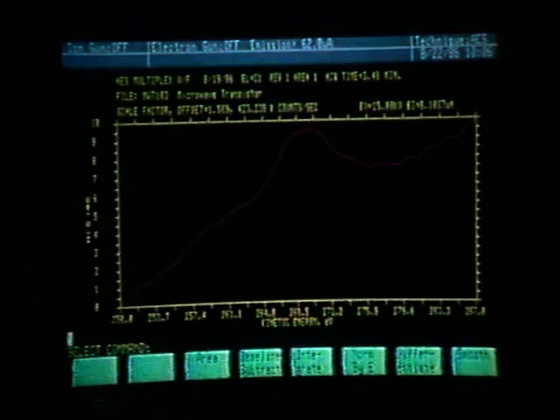Right now they have no functions assigned to those soft keys. In our original data bank they have functions, but because they are not valid on multiplex data, they are masked and do not allow us to manipulate this data using those functions. That is true in all of our soft key data banks.